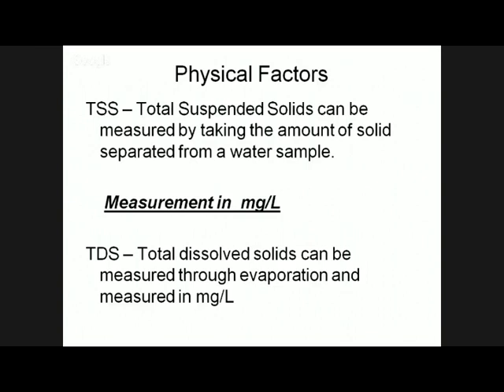Dissolved solid is also very important. It is determined by evaporation. You have to take the initial weight of the China dish and then the final weight. Accordingly, you analyze the TDS.